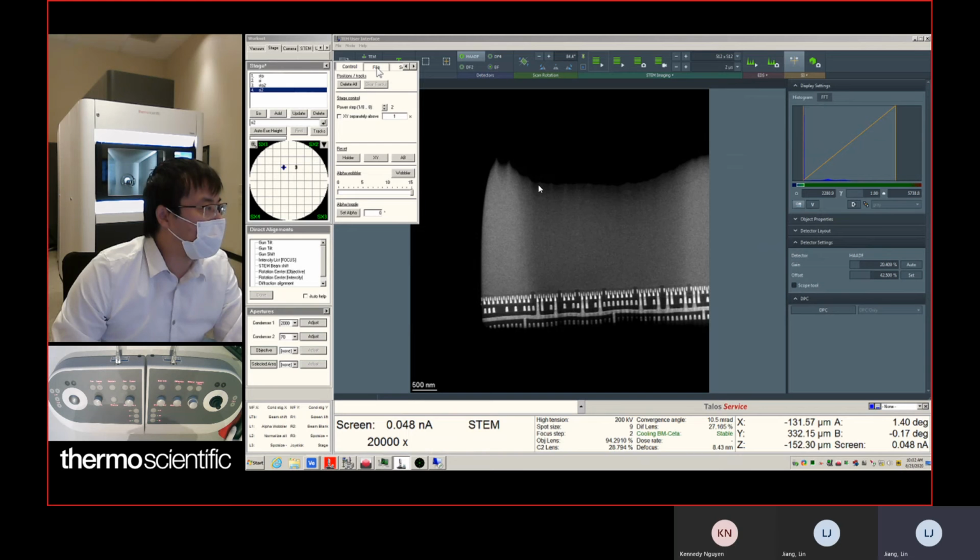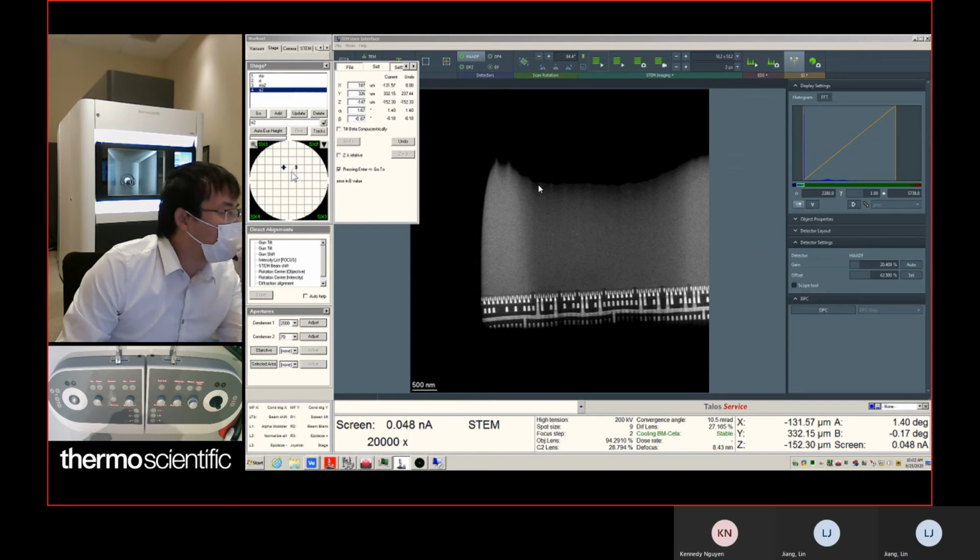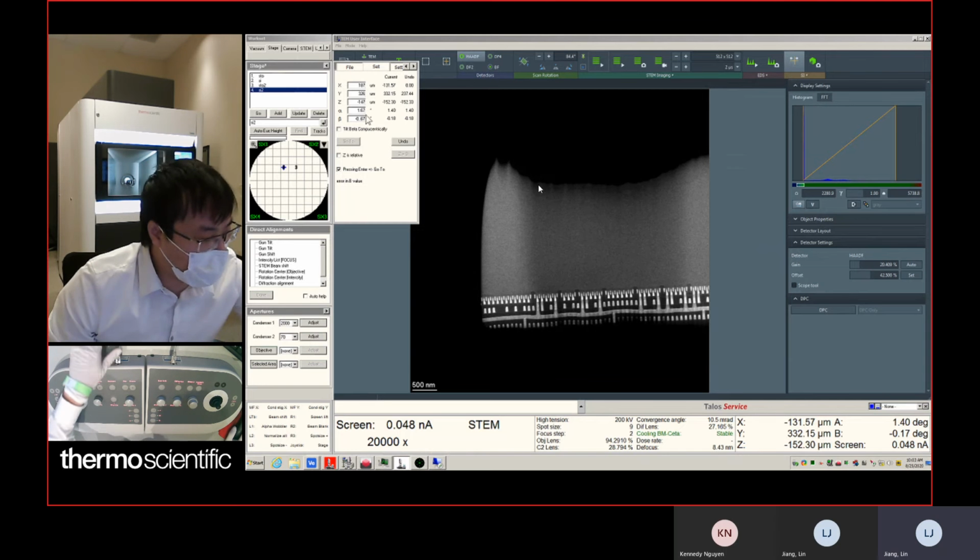Yeah, it's frozen a little bit. Anyway, oh, we got an error in the beta value. Okay, maybe this value is the same.